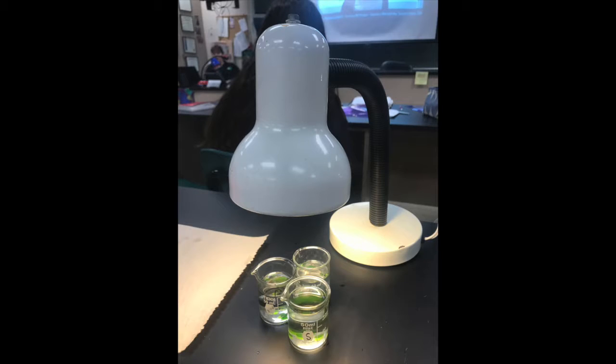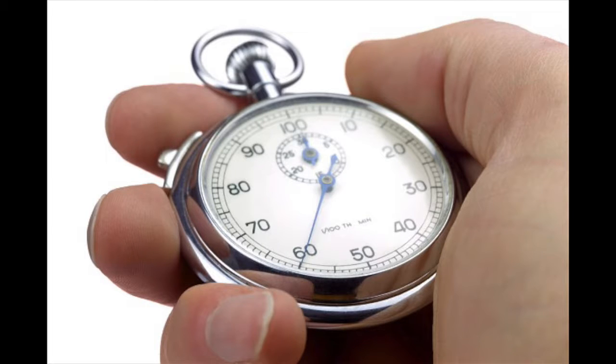Add the sunken leaf discs from each syringe to the beakers with 30 milliliters of sodium bicarbonate and place them under the lamp. Start a timer for 15 minutes and record how many floating discs there are for every 30 seconds.